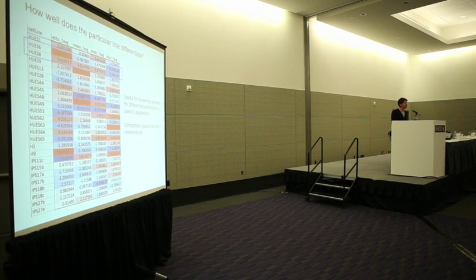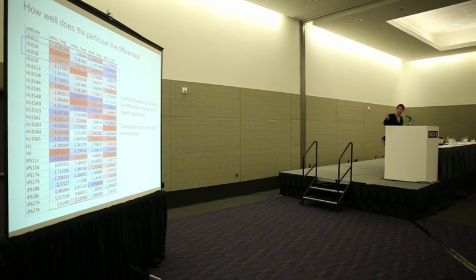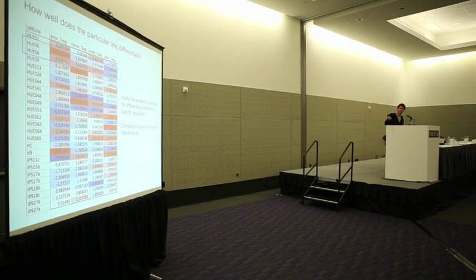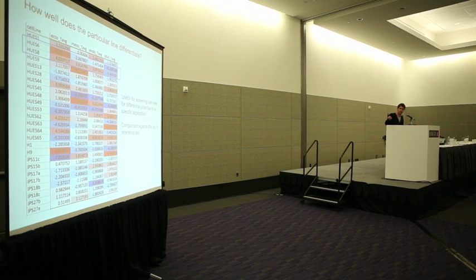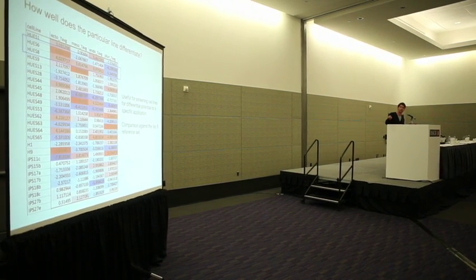And again, coming back full circle to the original example of hues 6 and 8 that I was mentioning, it's still nice to see that you pick up this very biased and inefficient endoderm differentiation of hues 6, but much more efficient differentiation of hues 8 into endoderm, that you again just pick up based on this gene expression signature and comparison.